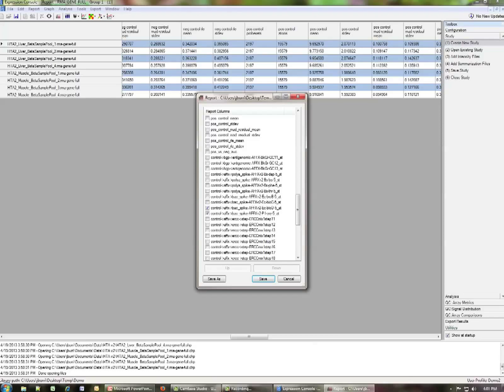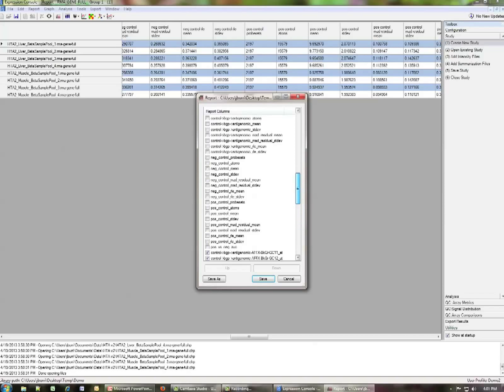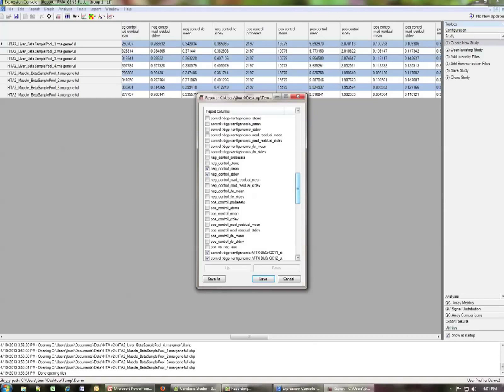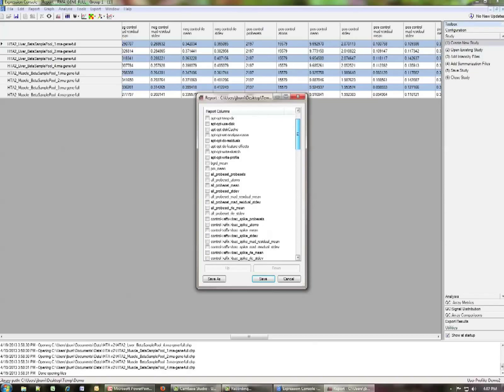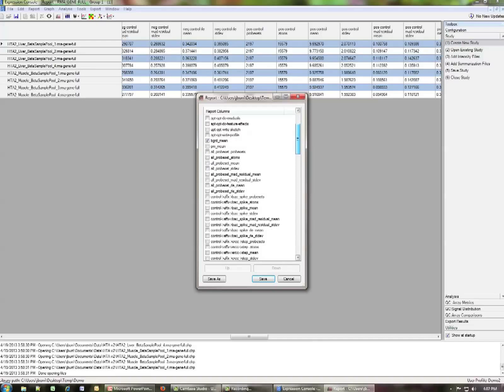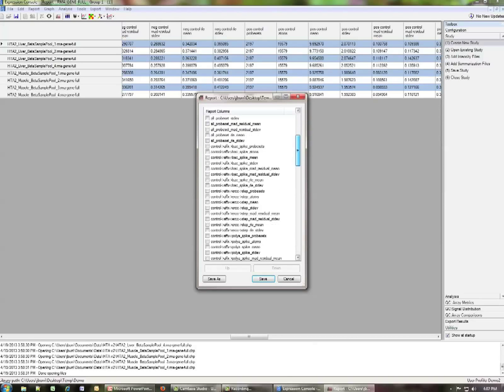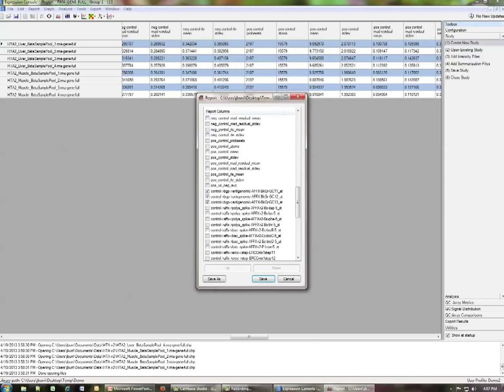And then we'll go ahead and we'll just quickly create a second one which only contains probe sets related to the background. So we'll take the three GC bin anti-genomic background probes. We'll scroll up. We'll skip over the positive controls. Here's the negative control. So take the negative control and its standard deviation. Here we have the anti-genomics and their standard deviation. And if we scroll up further, we have the background mean.